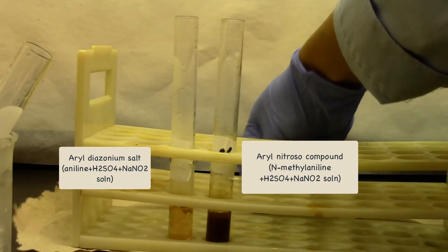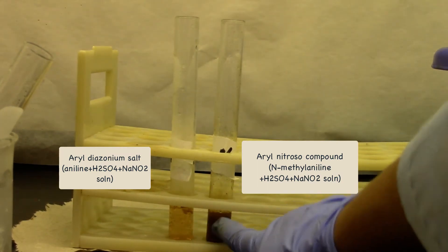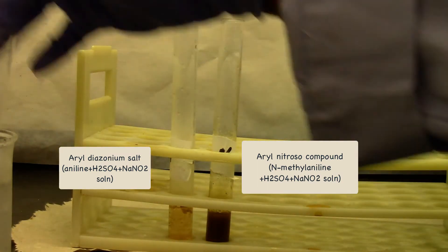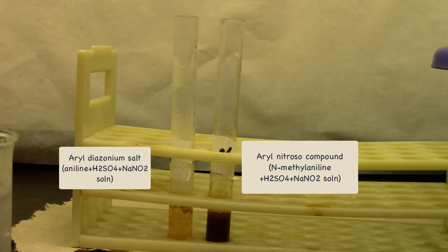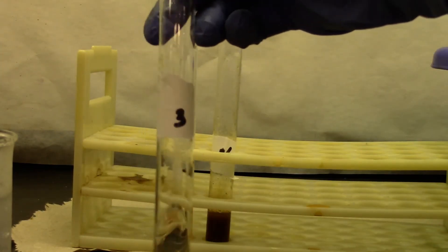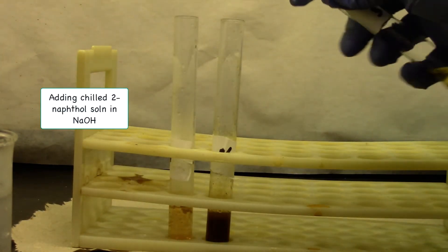Primary amine produces a red-orange dye with beta-naphthol solution, which is my solution 3.